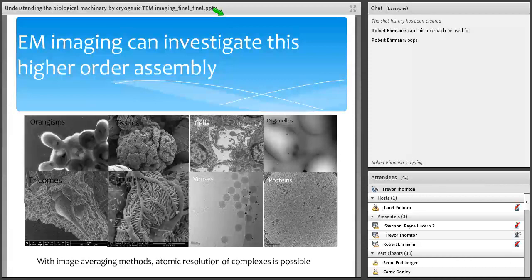So you mean that it's not necessary to have an aberration corrector, for example? No. Koch is an expert in aberration corrected microscopy and spectroscopy of elements, and they look at atoms routinely in non-biological materials. The reason they can do that is because those materials are conductive and they withstand large electron doses. Biological molecules do not withstand large amounts of electrons. We know that because if we get struck by lightning, we don't survive very well, whereas the metal pole next to you does just fine. Yeah, you're right.